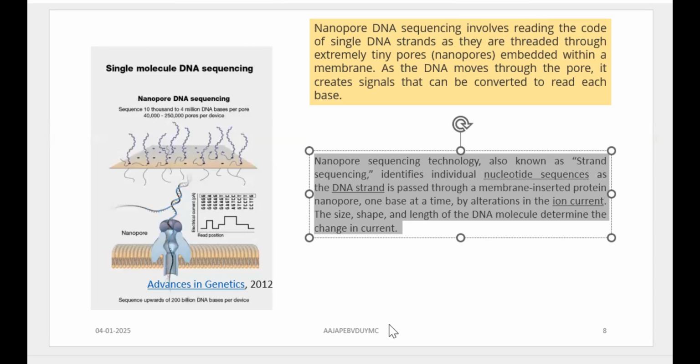So depending upon the nitrogen base, the size, shape, and charge is going to change, as it is going to be very specific for each molecule based on its molecular nature, and the functional groups attached will decide its charge. So, though an overall negative charge is there on account of phosphate, each individual nucleotide is going to have variations based on the functional groups present in it, right? The type of molecular nature it has. So each nucleotide is going to give a unique deflection when it passes through the nanopore.